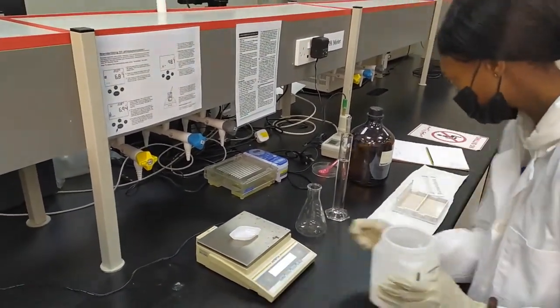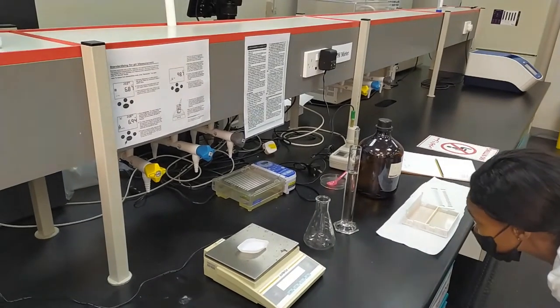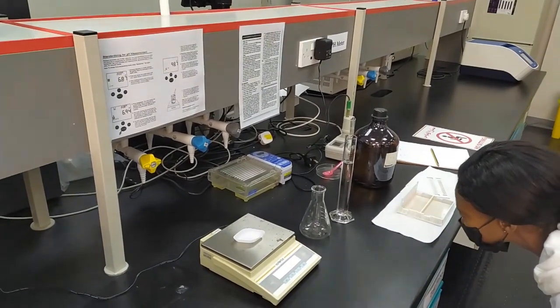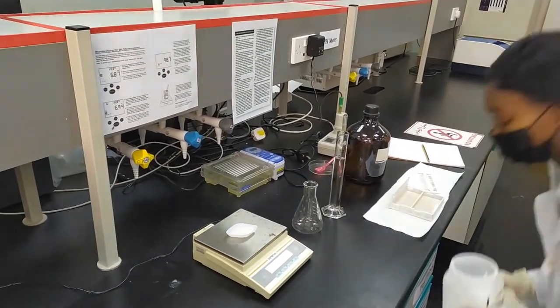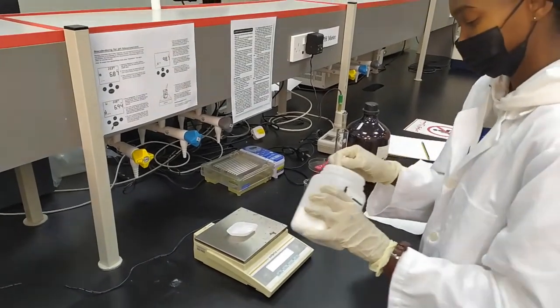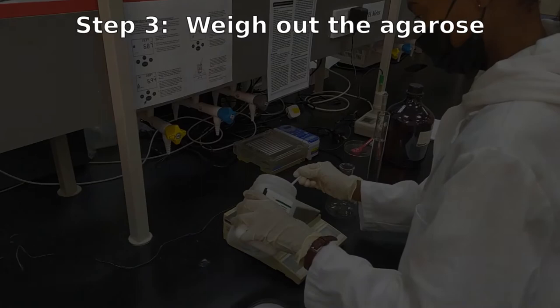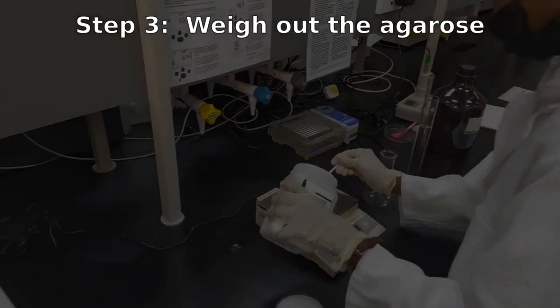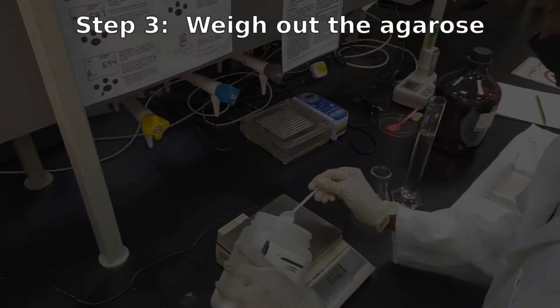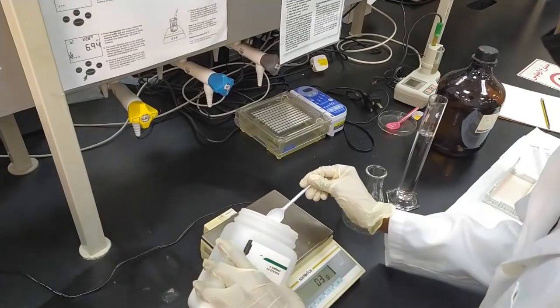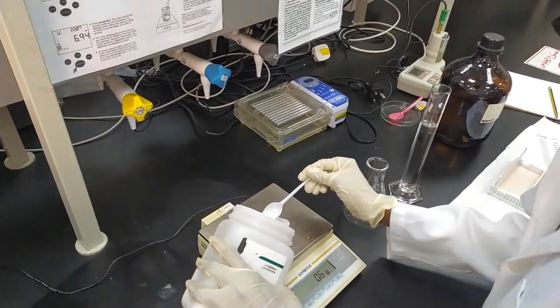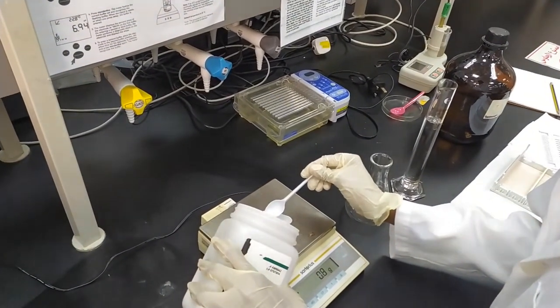And then, you're going to weigh out your reagent. And in our case, it's just 1 gram. So, it's very simple. You don't have to be absolutely precise with these. It doesn't matter if the DNA is running through a gel that is 1.0% or 1.05%. Your DNA is still going to run through it.